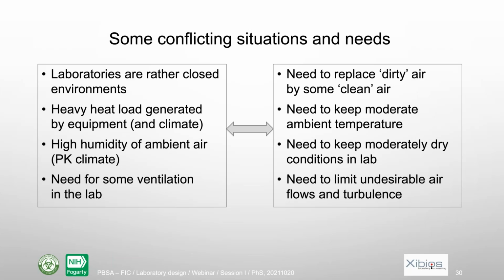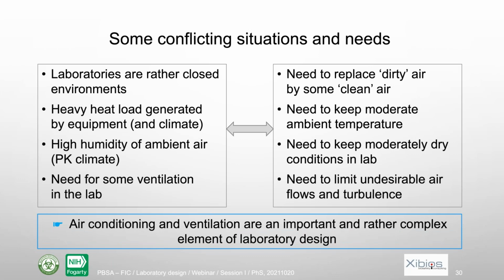And finally, you need some ventilation in the lab to remove the dirty air, but also you need to limit the turbulences. You need to limit airflow controls, and because of that, it's quite difficult to find a solution in principle. But you'll see that there are some solutions and some simple solutions. But anyways, in any project of constructing labs or revamping a lab, you should really look at this specific issue of ventilation.